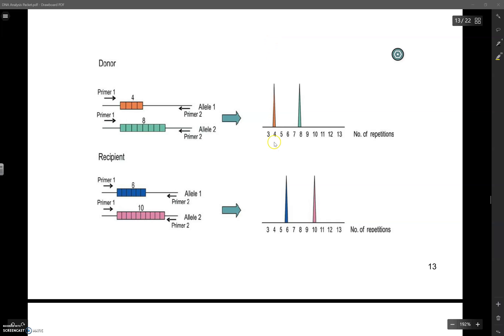So instead of running vertically, capillary electrophoresis, at least the diagrams we're going to look at, run horizontally. And what it's going to show are the shorter fragments towards the left and the longer fragments towards the right. So in this example right here, where it says donor, it tells us that there are four repeats for allele one and eight repeats on allele two. So these peaks are representing the DNA of each of those different alleles. Here we see the peak for a genotype of four for this particular region, and here we see a peak for a genotype of eight. Likewise, down at the bottom where it says recipient, the six is represented by this blue peak and the 10 is represented by the pink peak here. So the same idea as gel electrophoresis, it's just represented in a slightly different way.